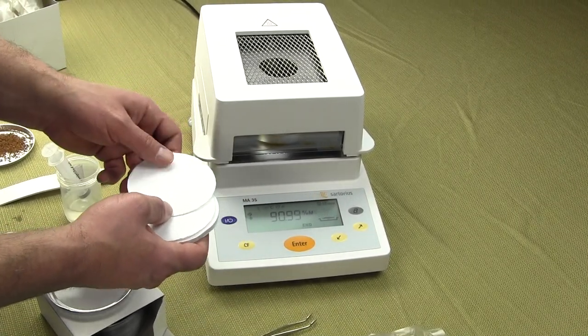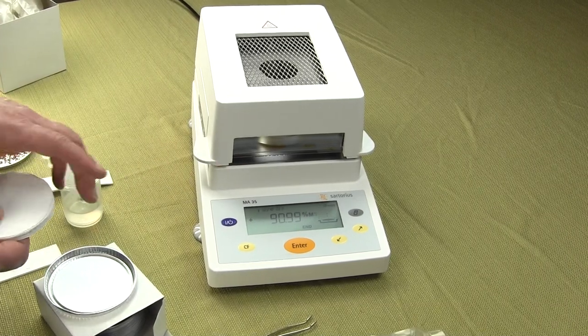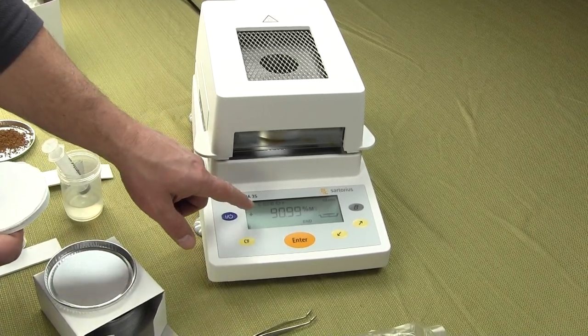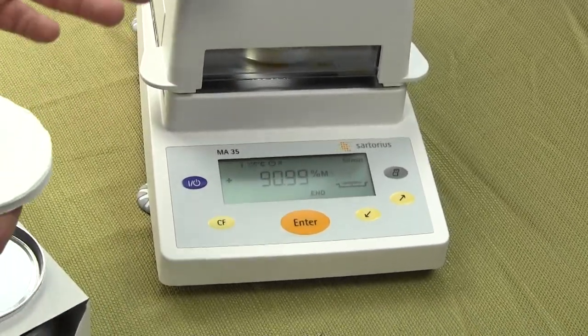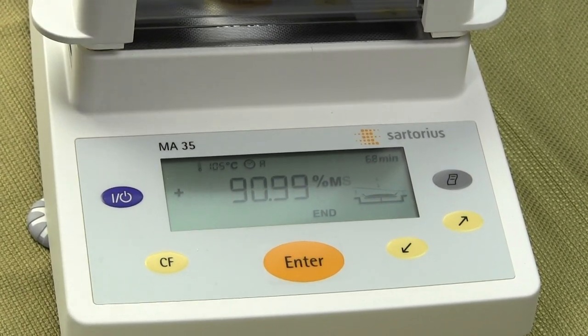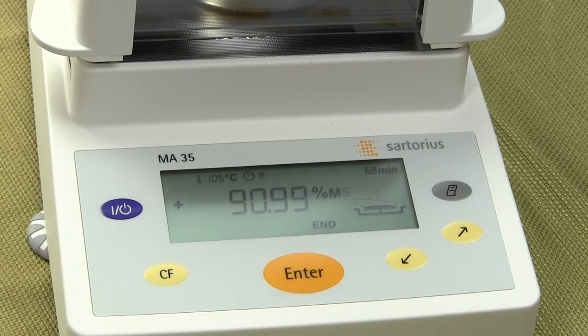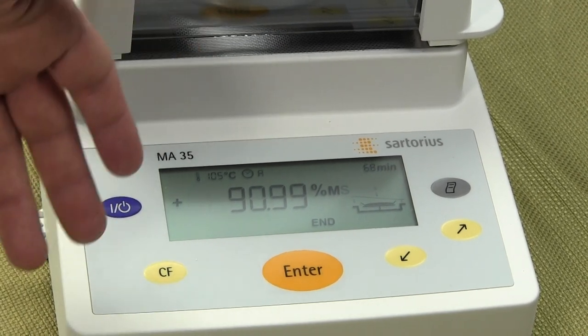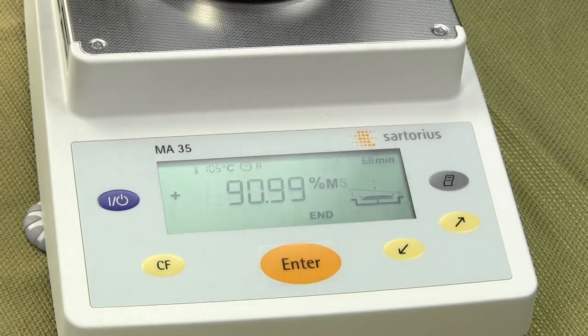Our test is now done — you just heard the moisture balance beep. We have 90.99% moisture, so solids-wise we have about 9% solids. When I made this solution it was roughly about 10%, so the balance is reading very close. This is how the balance works — it puts out the readings very simply.